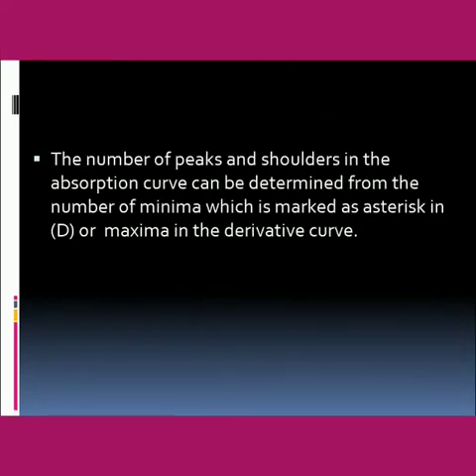The number of peaks and shoulders in the absorption curve can be determined from the number of minima, which are marked as asterisks in D, or maxima in the derivative curve.